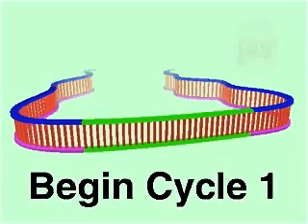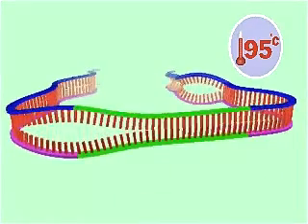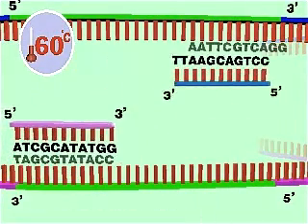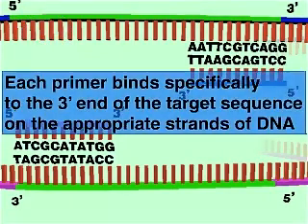In the first cycle of PCR, the DNA molecules are melted by raising the temperature to 95 degrees. After the strands have separated, the temperature is lowered to 60 degrees so that a pair of short oligonucleotide primers, specific for the 3' ends of the target sequence, can bind, one primer on each strand.